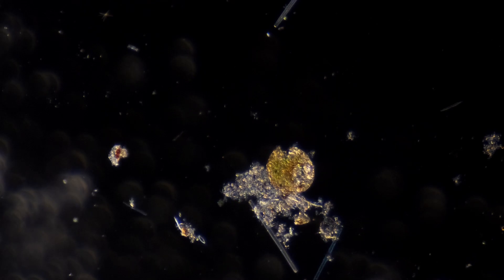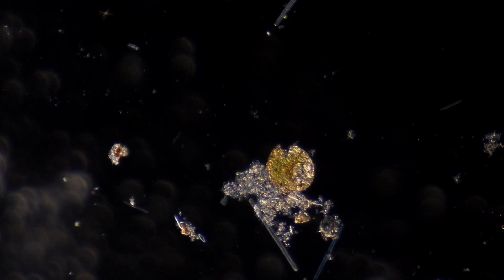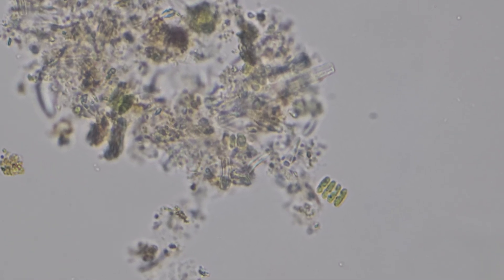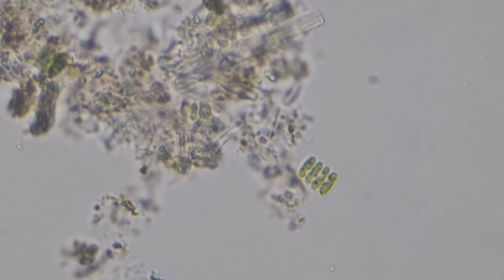For example, some diatoms, as you are about to see, can move about on their own, just like animals, though the method of their mobility is different. Here we see a collection of sand, possibly some humus from the surrounding forest soil, and the shells of dead diatoms mixed in.